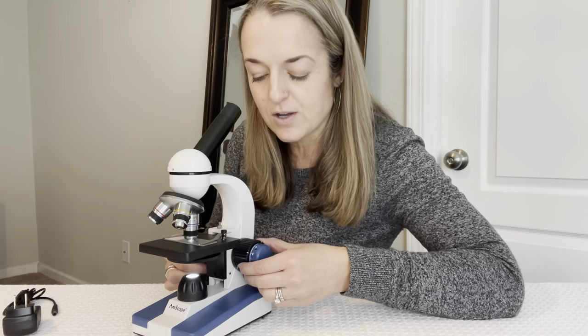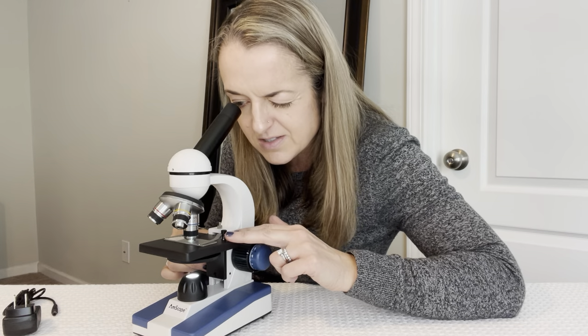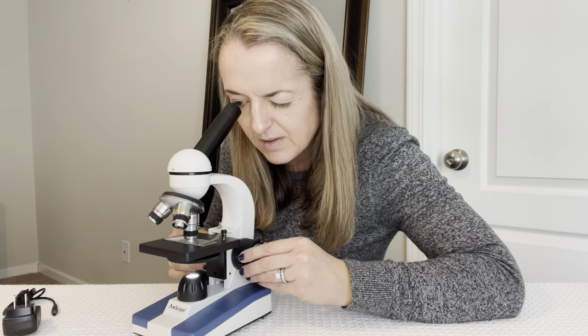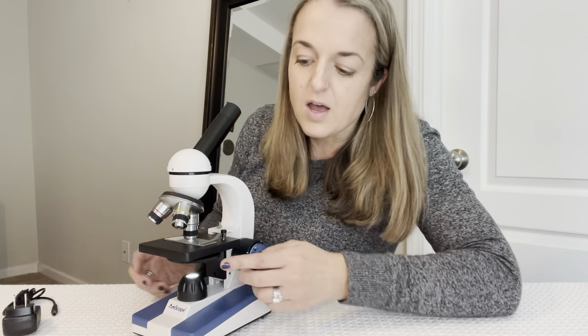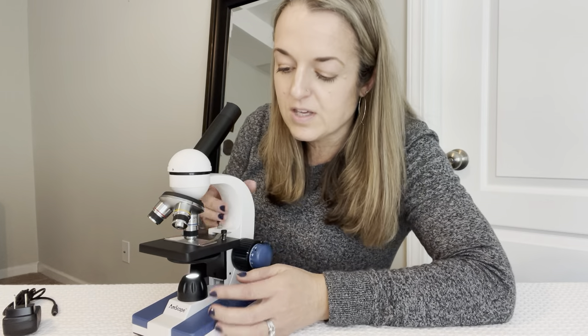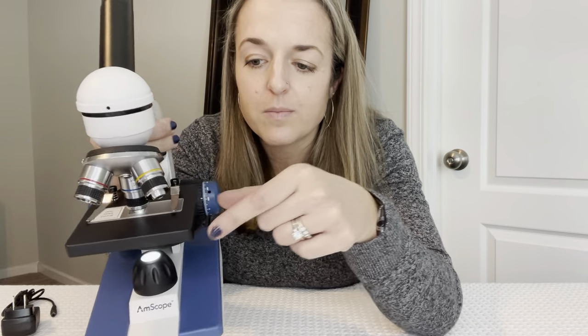The black dial here is what will raise and lower the stage table, and it's very easy to rotate as well. This dial on the table itself will change the color that's coming through when you look through the microscope — it changes the colors.